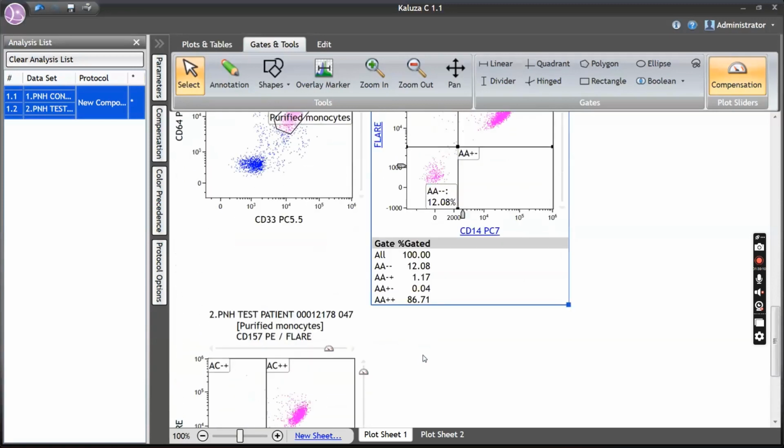You also need to give separately PNH clone detected in neutrophils and PNH clone detected in monocytes. And then the final report. You should give an impression like evidence of PNH clone detected in neutrophils and monocytes. And then you need to give the percentages. That fulfills your report.